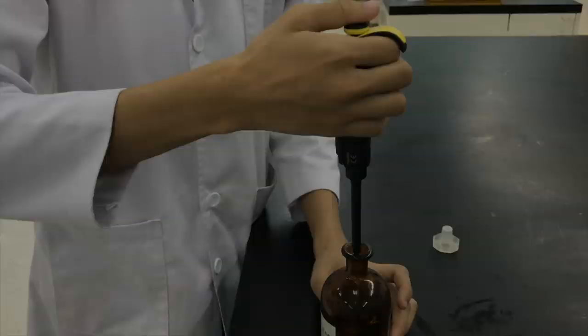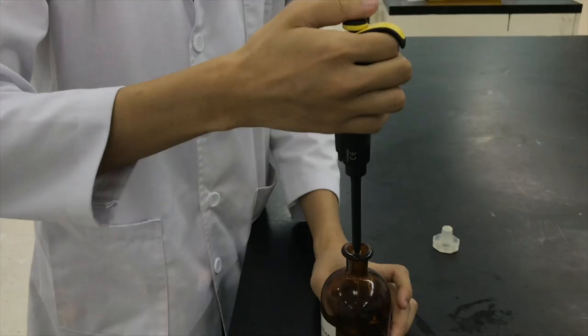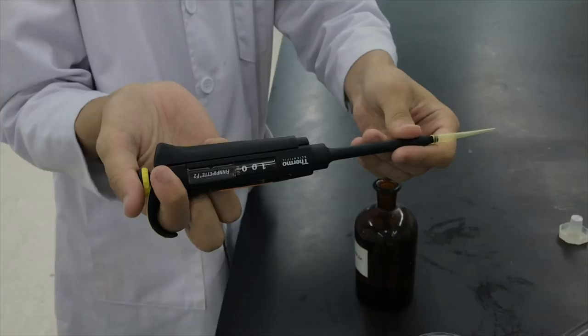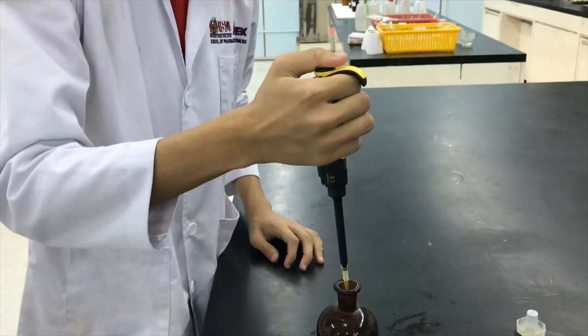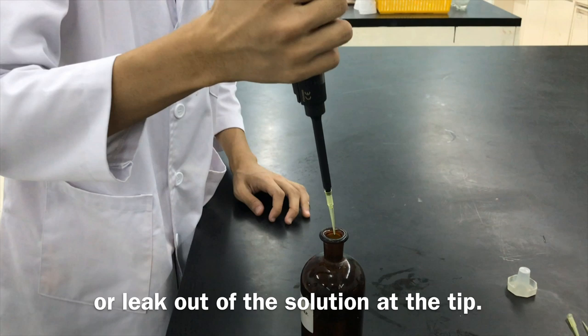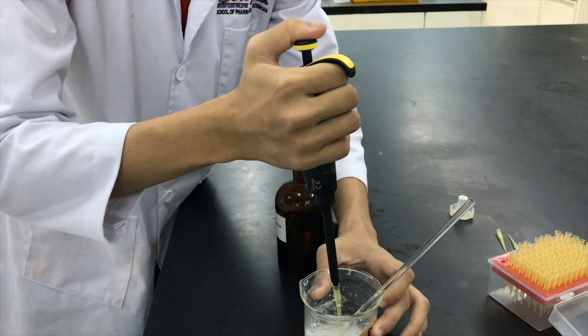Set the micro-pipette to 10 µL and transfer the methyl salicylate into the beaker. Set the micro-pipette to 100 µL and transfer the eucalyptus oil into the beaker. Make sure that there are no air bubbles or liquid at the tip. You might shoot the solution down the wall of the beaker or just shoot it at the center of the beaker.